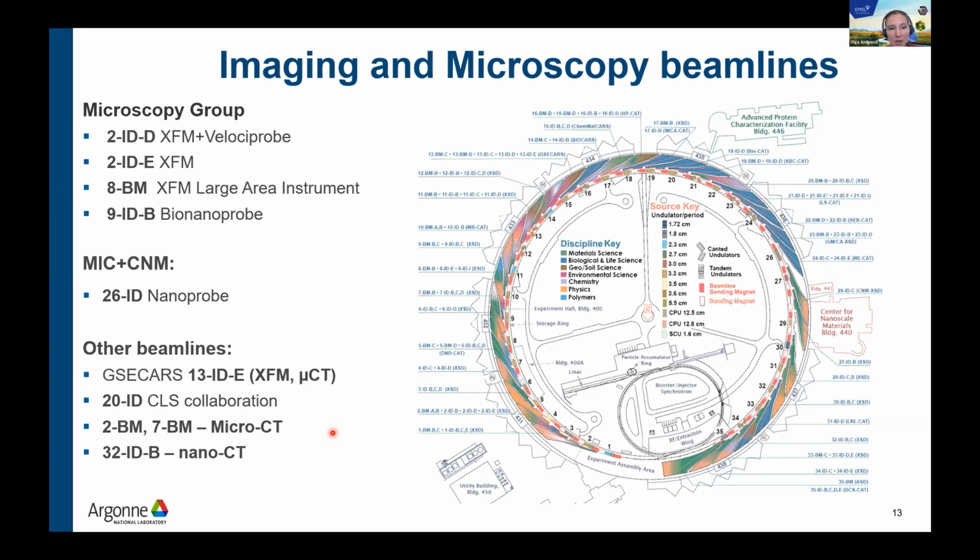After APS undergoes the upgrade, we will get a better beam, which will give us way more flux than we have right now, and it will enable new science for us, or the same science but at much higher throughput or with much higher resolution than we can do right now. For 8-BM, for example, we will not only increase the resolution from 20 microns to 5 microns, we will also use a different monochromator, which will enable faster scans, and we will have X-ray fluorescence tomography.